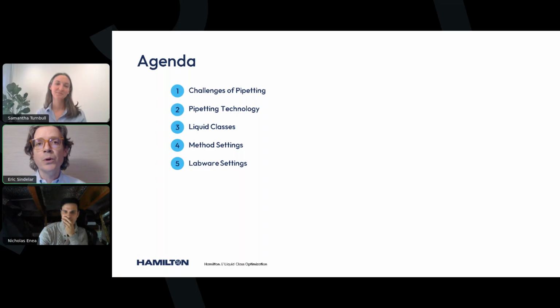So for the Hamilton portion of this presentation, I wanted to cover a few different topics. First, talk about the challenges in regards to pipetting, how we account for that from a technology perspective, and then dive a bit deeper into liquid classes before I hand it over to my colleague Samantha Turnbull to cover method settings and labware settings that play a role in facilitating proper liquid handling.